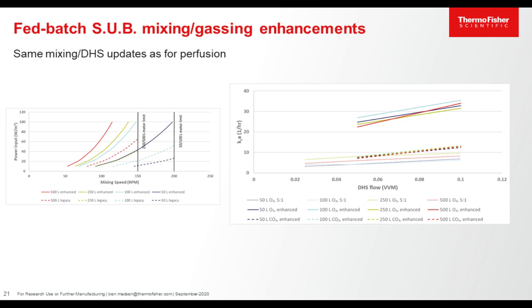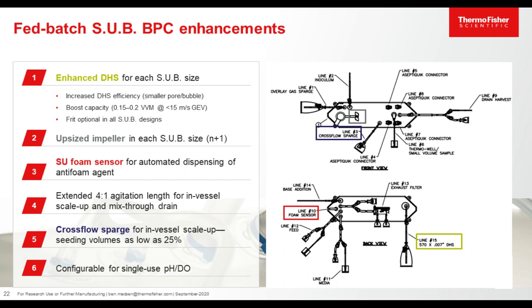But I point out that the lower kLa relative to the perfusion isn't necessarily terrible, because we're still seeing much higher kLa capability with this Sub design compared to our legacy Sub designs, as you can see in the graph.